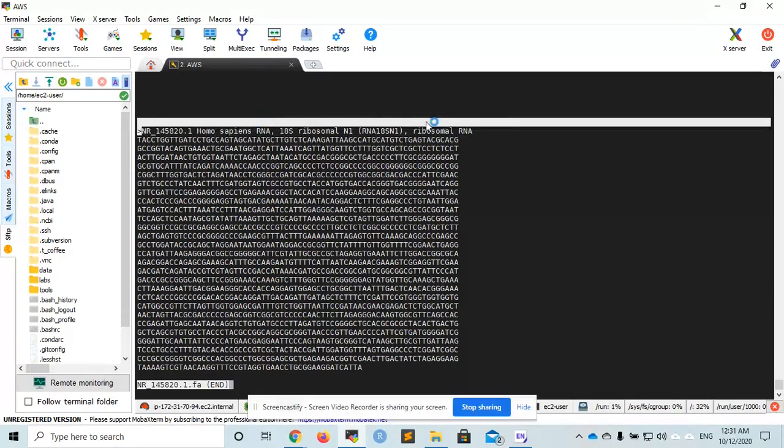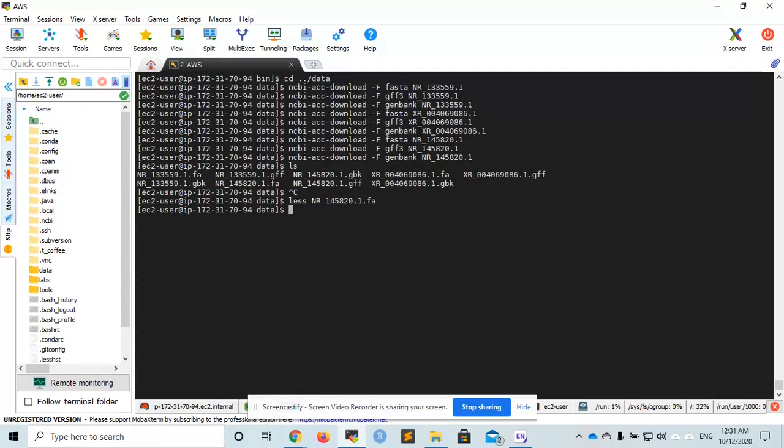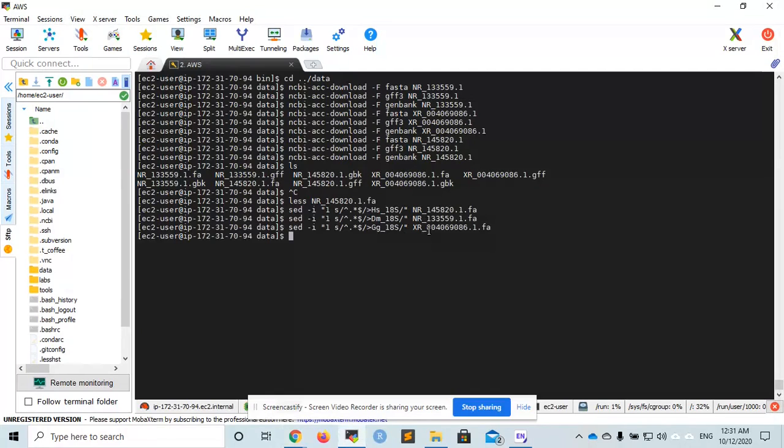Now, if we open the FASTA sequences, we will see this header. We can rename that so that we have only the name Homo sapiens. To do so, I will use the command sed. You can read more about this online.